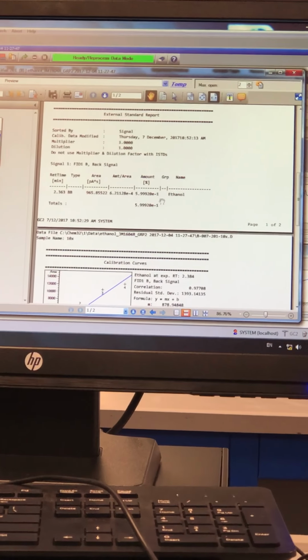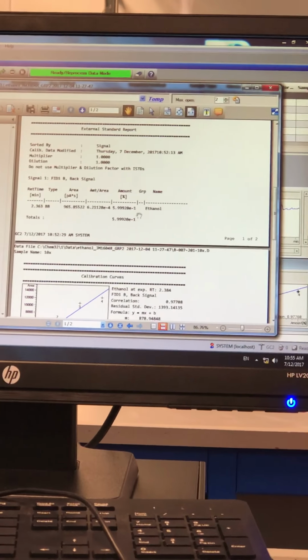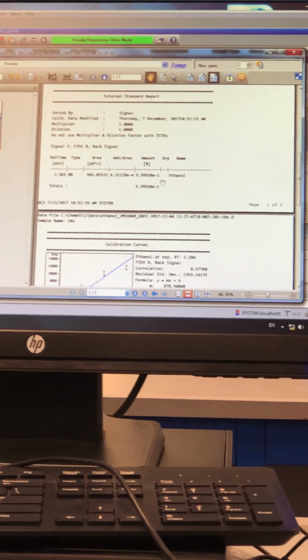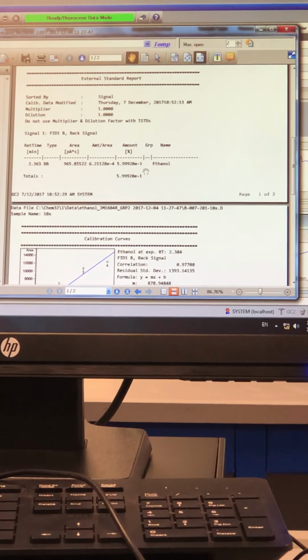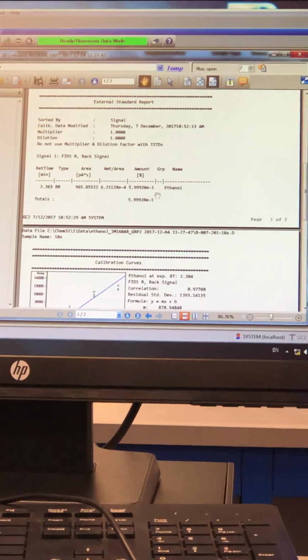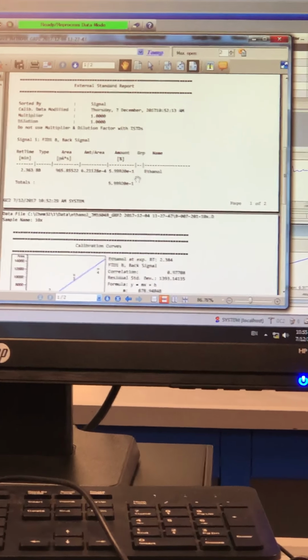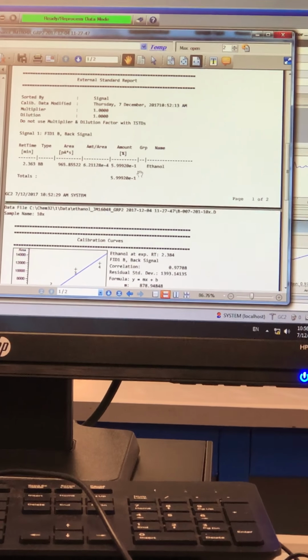I cannot pause my video, so my video will be rubbish here. From 21 minutes to 23 minutes is rubbish. I think the retention time is too off. Later on, when you overlay again all the standard numbers, you will realize that your peaks drift a lot. For your unknown numbers, P5 and Z5, you must not overlay. You can view your sample result.